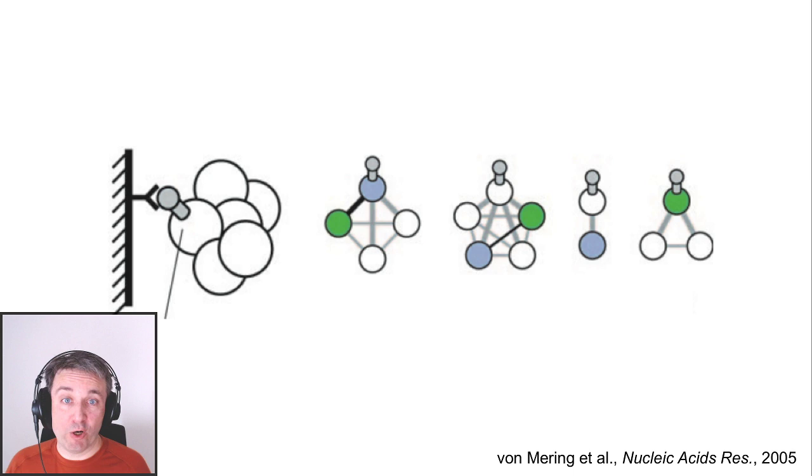The real problem here is, how do you turn this into a number? That's not at all clear, but I hope it's clear that the first two pull downs are positive evidence and the last two pull downs are negative evidence. The more often we see these proteins together in pull downs, the more we will tend to believe that these proteins interact. The less we see them together in a pull down, the more often you see one but not the other, the less we're going to believe that they're in a complex together.